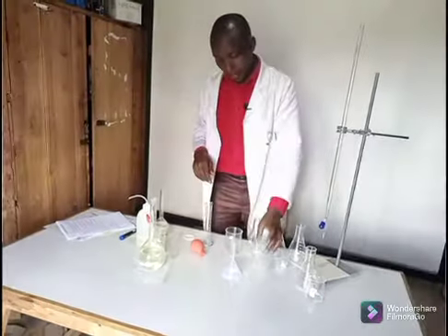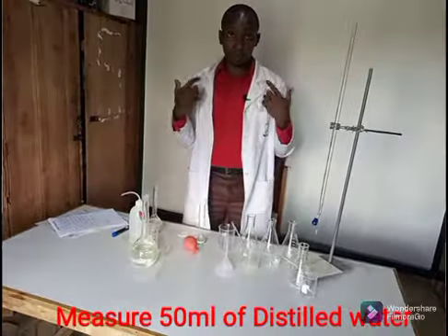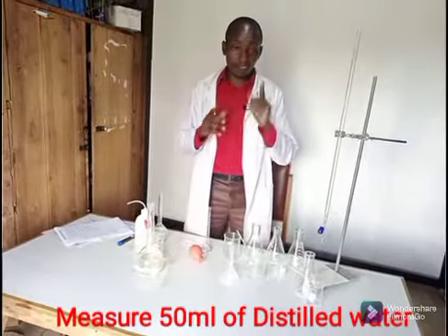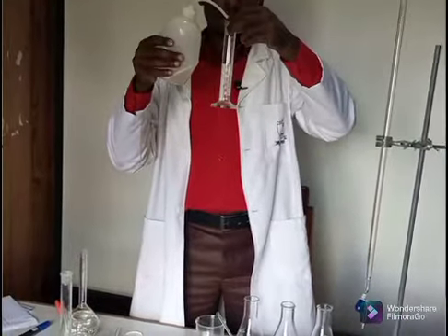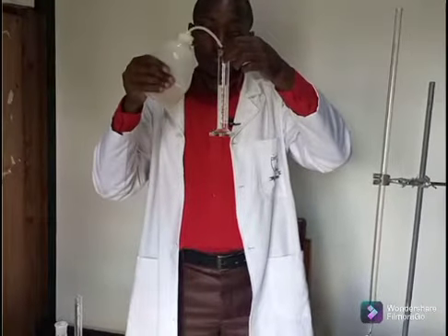Then remember the next step. The next step, I'm supposed to measure 50 cubic centimeters of distilled water. So I'm going to use the same measuring cylinder and measure 50 of distilled water.